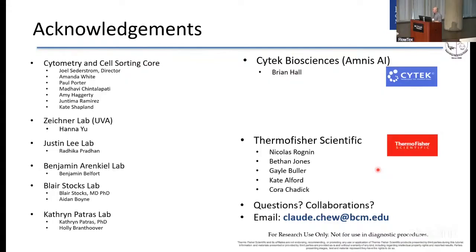Obviously, we're still in the very early stages, but the goal would be to put something like a CellPix or something high-speed Brightfield imaging in a lab where you can just throw a sperm sample on, run it really quickly, throw it through a model, and have it spit out a classification for a clinician to then sign off on. So that's the pie in the sky goal, but we're at the very, very early stages of that.